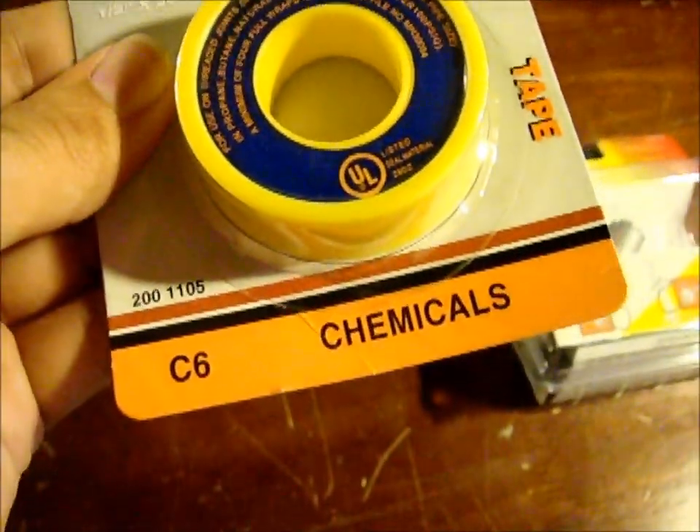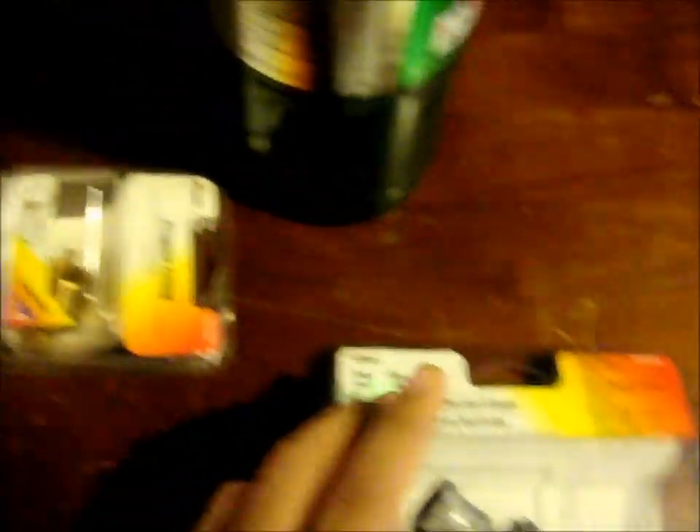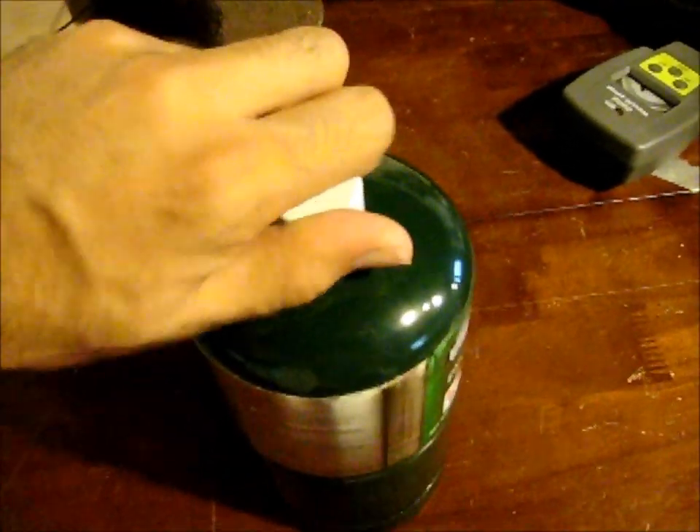I'm going to need a barbed fitting. I'm going to need Teflon tape — this is a special type of Teflon tape for flammable gases, so you want to get the yellow Teflon for fittings that will be addressing propane. Also a pressure regulator, and a fitting that will go from thread to the nozzle of a propane cylinder. We'll take a close look at that here in a minute.